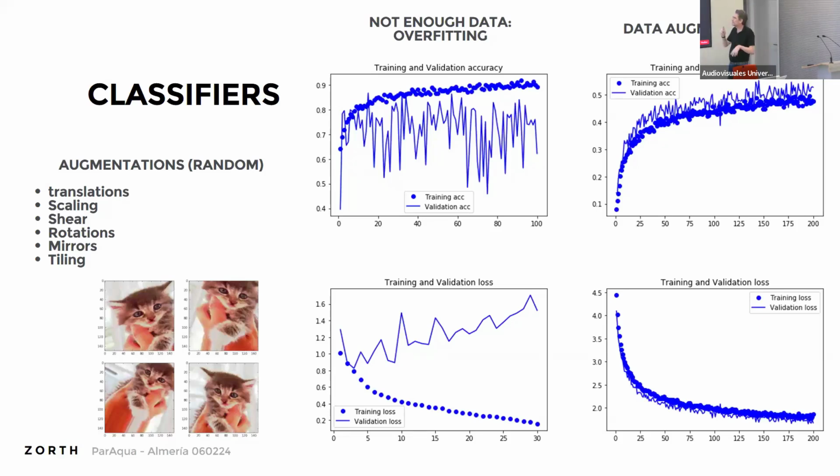This one is to take with a lot of precautions, except if you're doing an object detector, because an object detector is scale invariant. You need to know a little bit about this kind of stuff. If you don't, you can always ask me, because I've probably made all the mistakes that you're going to make.